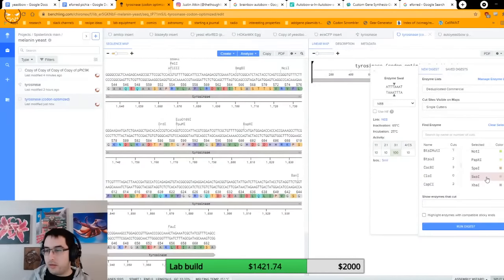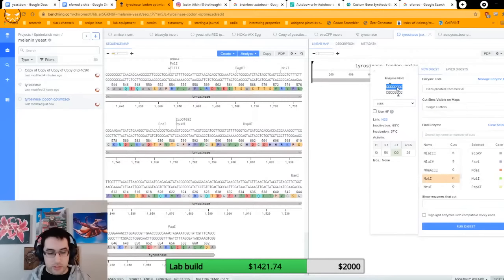So now I can scroll down, grab this one. Again, it's one I use all the time, copy. Now, there's one problem with this gene as it stands.